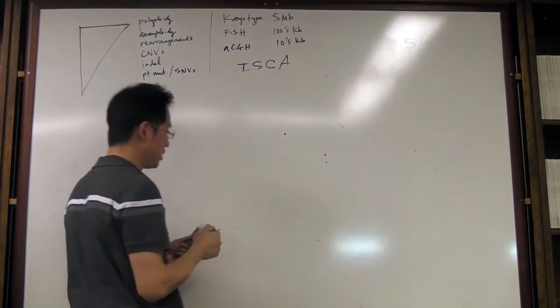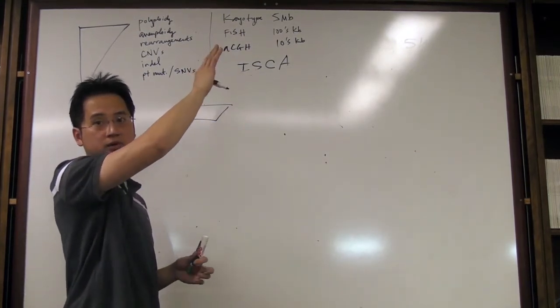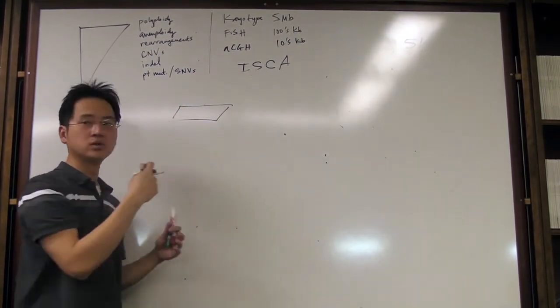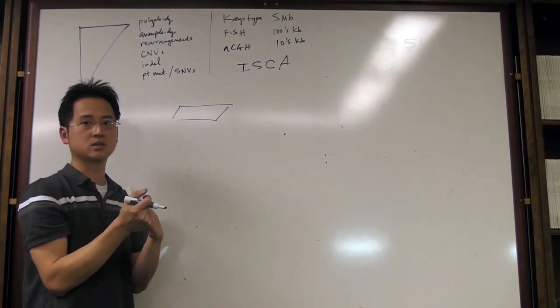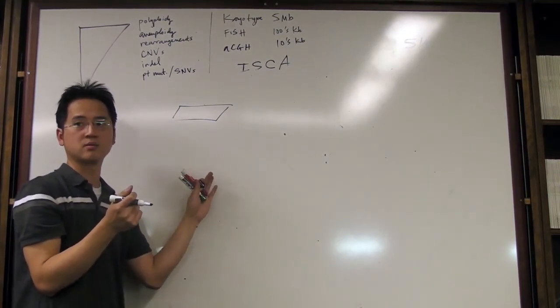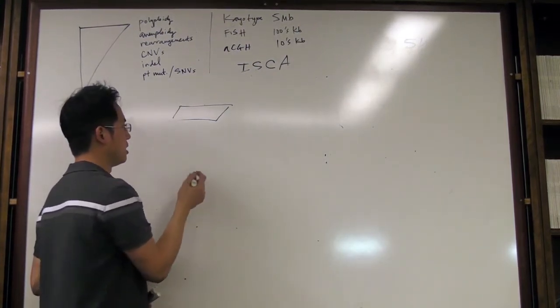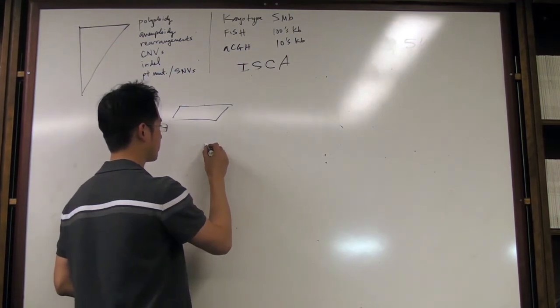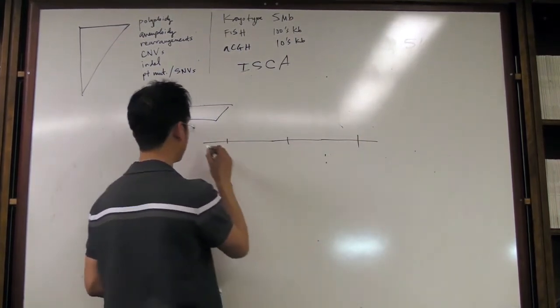So if you were to design an array that can give you the copy number change, that's fine, right? But in addition to that, built into a functionality into the array that can allow you to do SNP detection, then you can do uniparental disomy at the same time. So the way you do this by Agilent's method is you take the DNA and you shear it with enzymes.